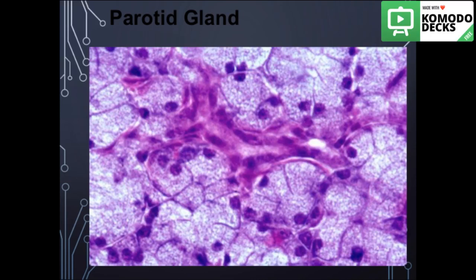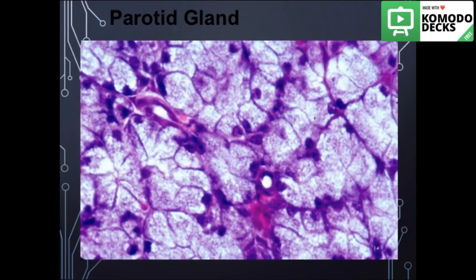These cells have a contractile function, to push out the mucus, increase the pressure, and increase the outflow of the serous secretions. Also, we see the mucus acini, the intercalated ducts in between, and the other look of striated ducts, which have a wider lumen.